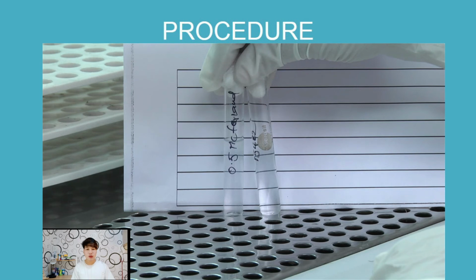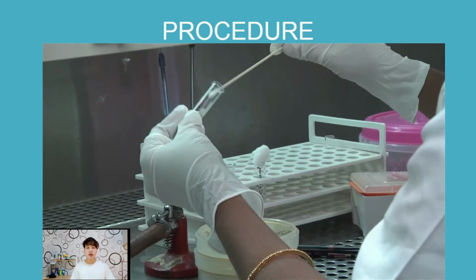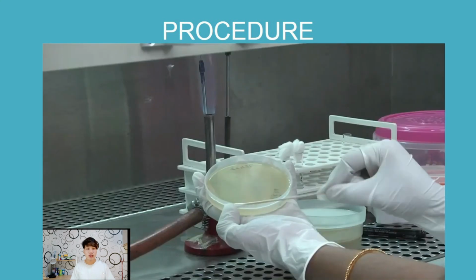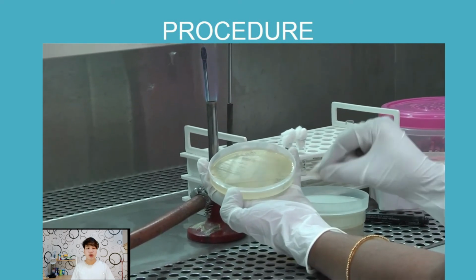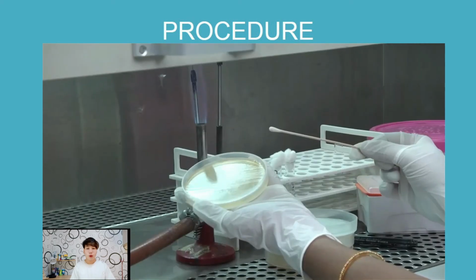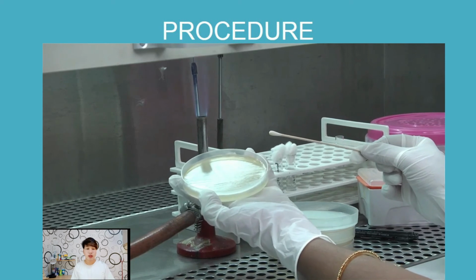In such case that the suspension is more turbid than that of the standard, it may be diluted with sterile broth or normal saline. In such case that the standard is more turbid than the suspension, you may add more colonies to the nutrient broth. Shake the tube well before use. Using a sterile cotton swab, inoculate a sterile MHA by streaking evenly in 3 different directions on the surface of the medium, also known as the lawn stroke method. With the Petri dish in place, allow to dry 3 to 5 minutes but not more than 15 minutes.